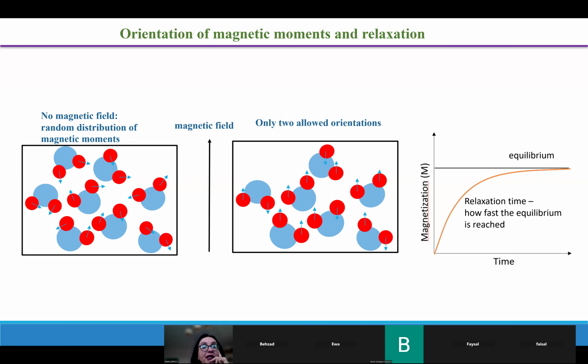Then, what can one say about the hydrogen atom? It includes a nucleus, and this is actually a proton, and 1 electron. Yeah, this is the simplest atom. Let us forget about the electron. Electron can be important, it will be important for electron spin resonance, which we also have in our lab. But at this moment, we are dealing with nuclear spin resonance, so we focus on the nucleus. And now the story starts. Because protons have magnetic moments.